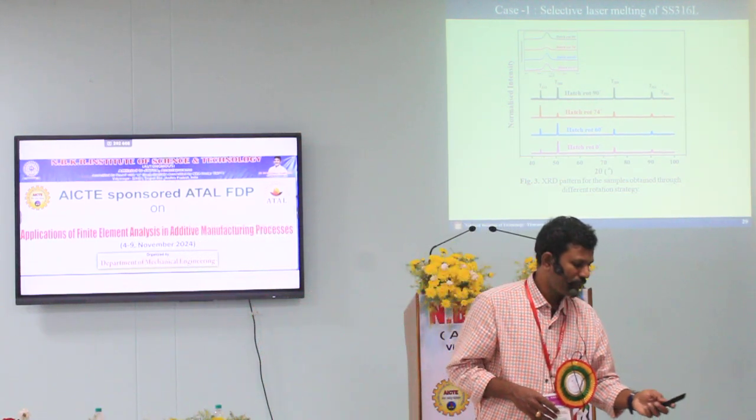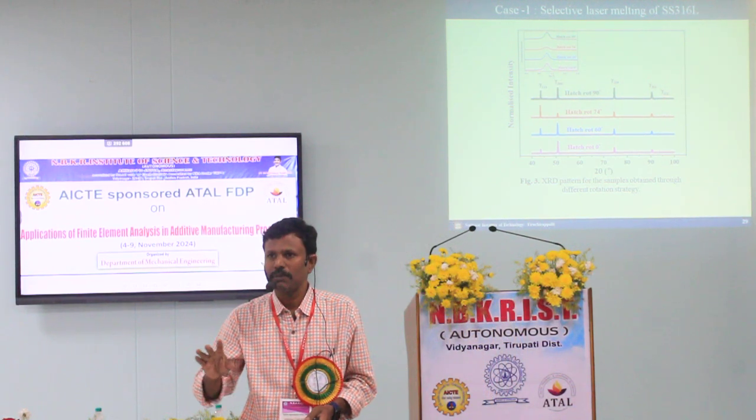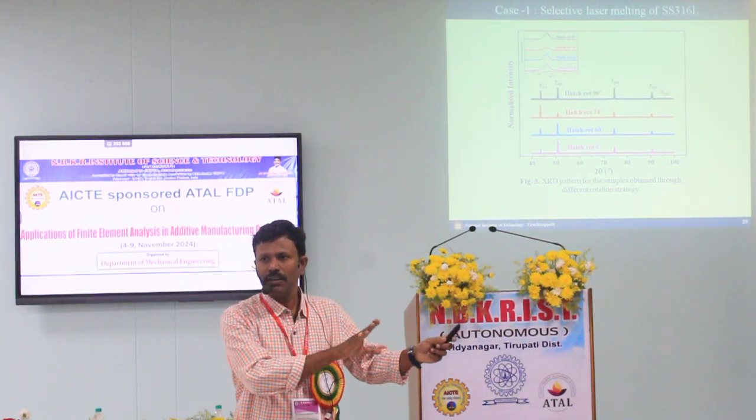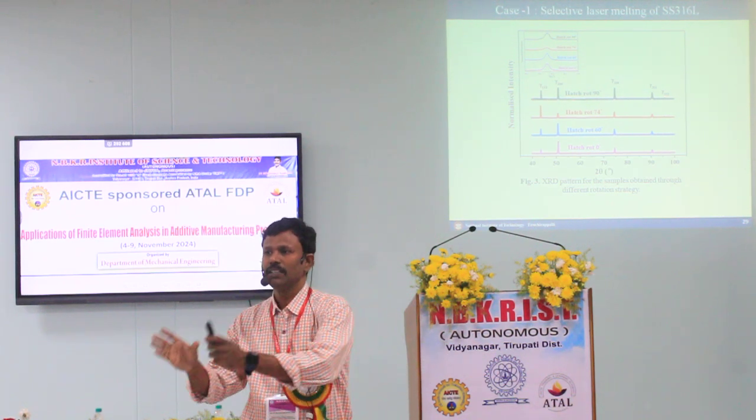In additive manufacturing, there is one thing we can have: in situ techniques have become very popular. The same XRD, in situ XRD, became popular. Optical systems, in situ optical systems.